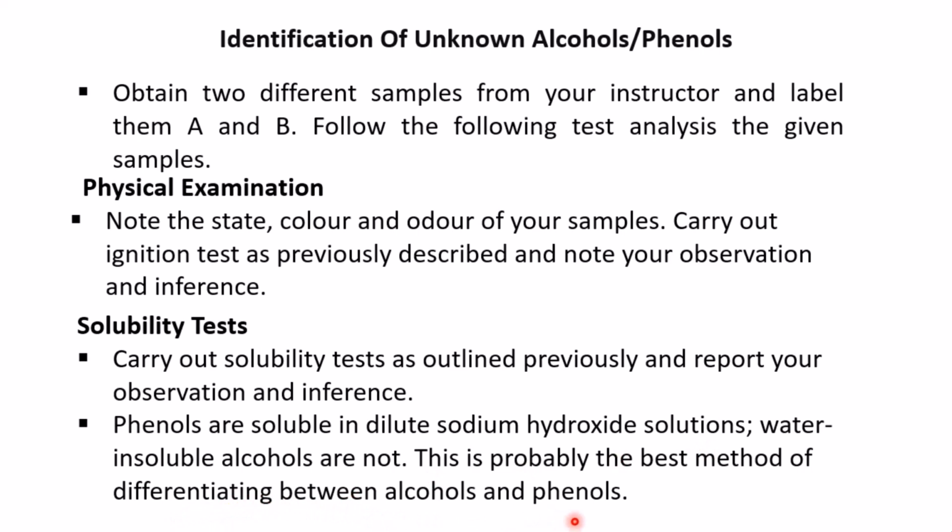So, water-insoluble alcohols do not dissolve in dilute sodium hydroxide solution. However, phenols will dissolve in dilute sodium hydroxide solution. So it helps you to identify an OH group on an unknown compound as being a phenol OH group or an alcohol OH group, right?